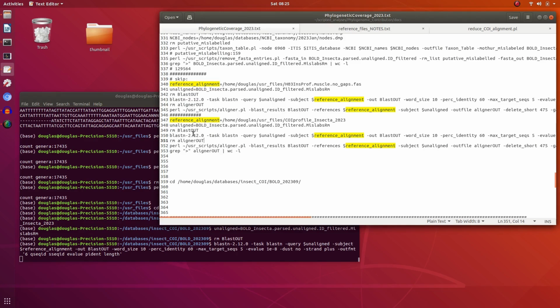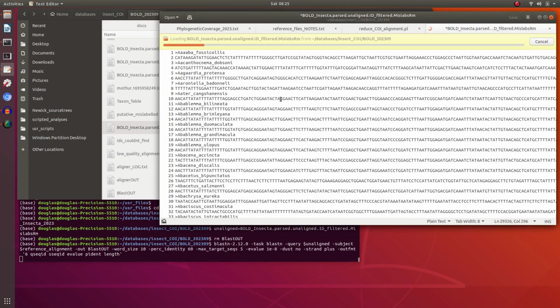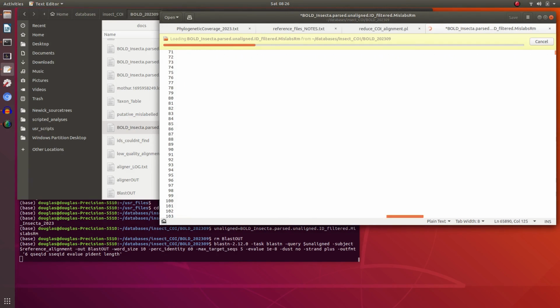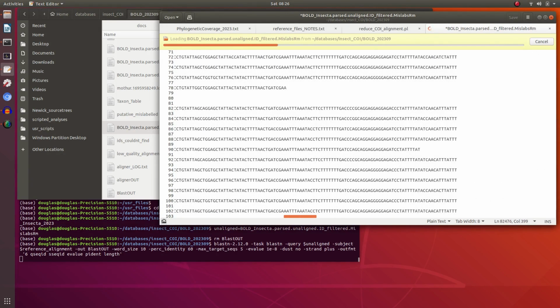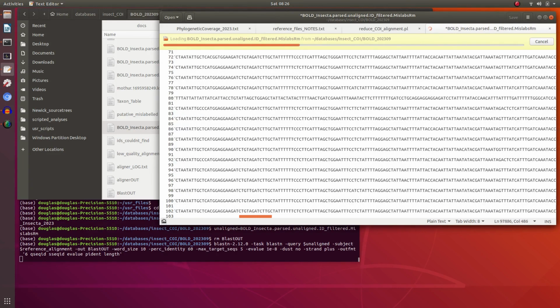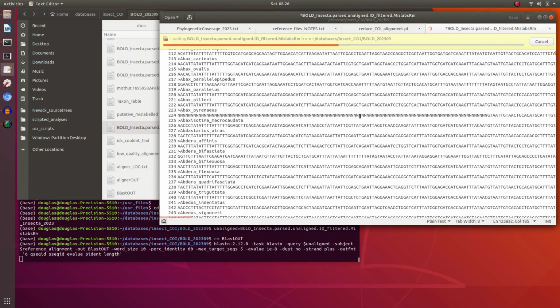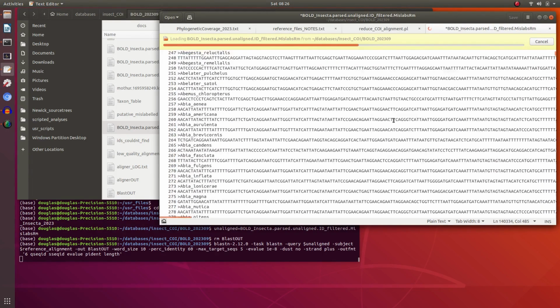There's a few tools to do that. I have my own, and it uses a standard approach, BLAST and then pairwise alignment. What I've done today is I've remade the profile. So let's have a look at the original profile first. Here's what I'm going to align. You can see it's not aligned, but should be, you can see the similarity anyway, so it's not a particularly difficult job, although there are some messy things in there.